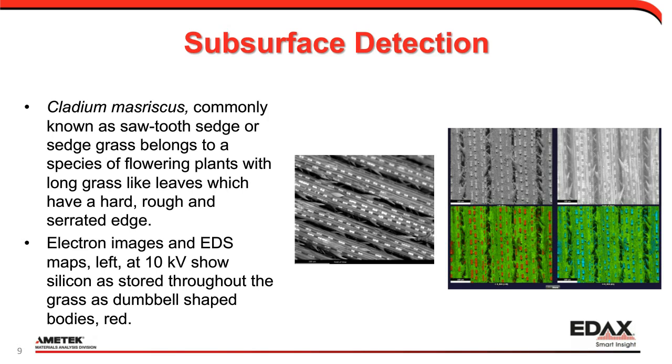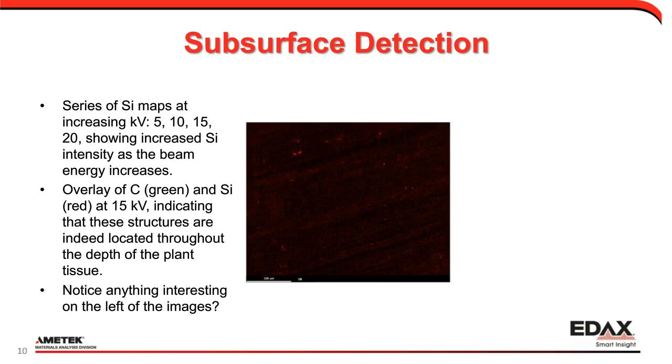Of course, because I did the study and at 10 kV I was able to get really nice signal, the following year when I had some interns helping out, I said, let's revisit this whole project because it is pretty cool that we can see elements below, that we hadn't seen at low kV. So why do we see the signal at higher kV rather than not see it at low kV?